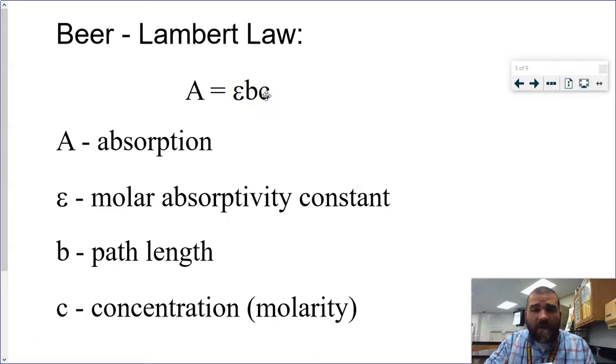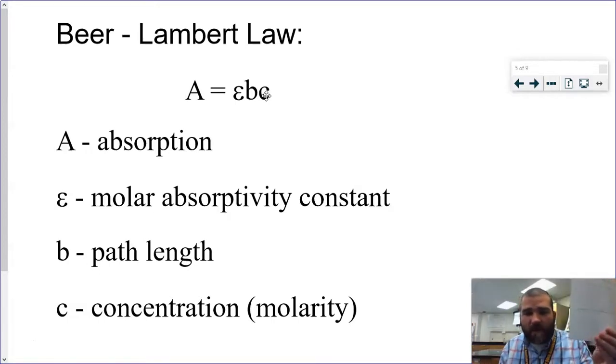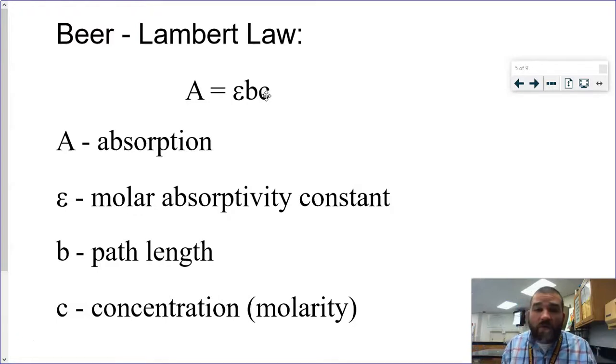Now we have just collected data. You can't see it because I'm in the corner now. I've shrunk my screen, but you have collected data. We have data on absorbance, and we're able to calculate the molarity of M2 for all of these different trials, or all of these different samples that we ran with the blue dye. So let's go to Google Sheets.